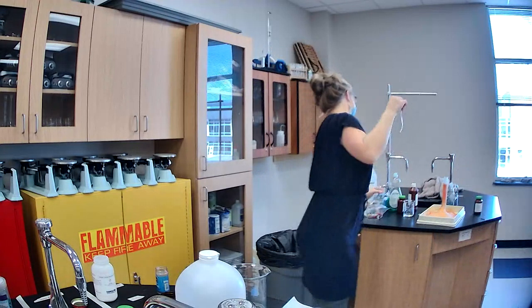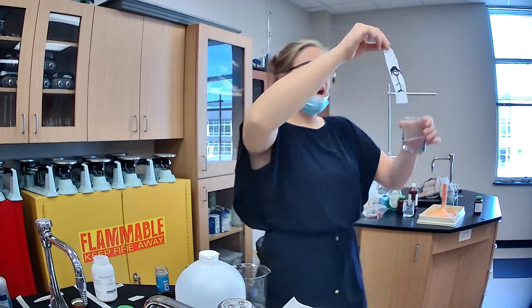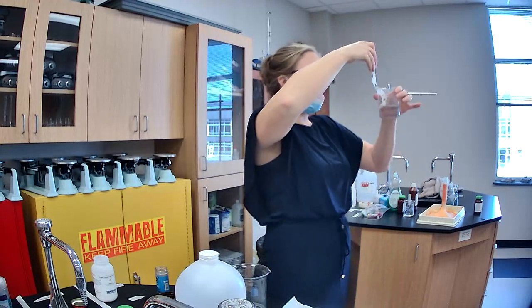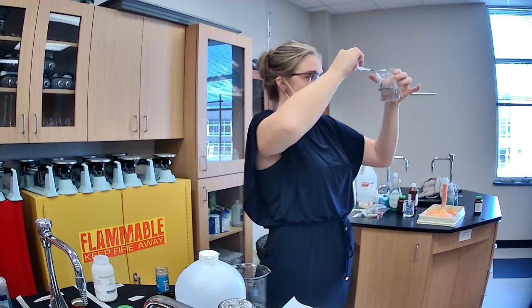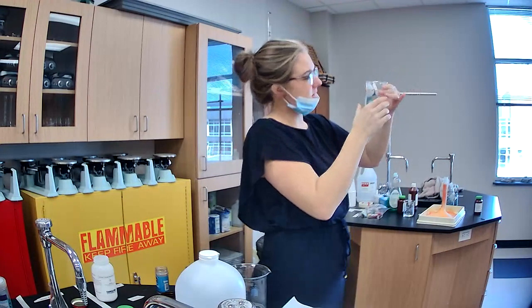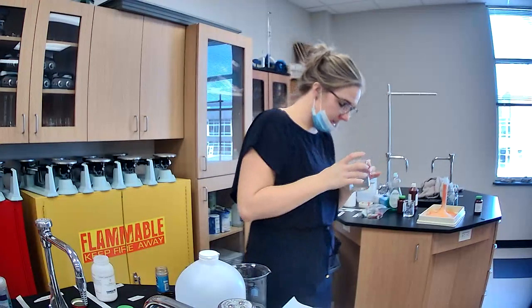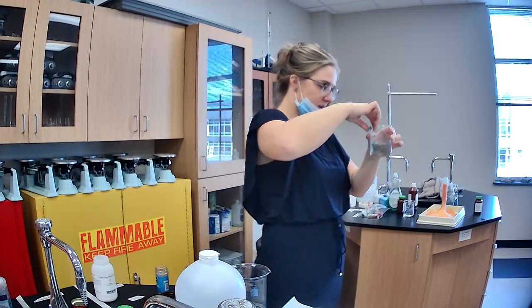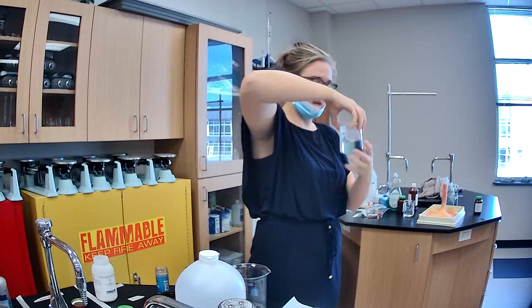All right, here's our little guy. I'm going to put him in the water, but again, not going to let the ink touch the water. A little bit of it touched, but you'll see in just a second, it starts to carry the water up, and we're going to see what kind of colors are actually in our marker.